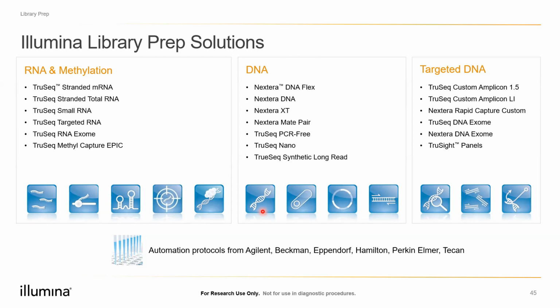Okay. So this, I think I will have to get back. I will get back over email on which kit for ChIP-seq can be utilized. And the instrument depends on how many samples you have and the data you require. So in that way you decide which sequencer to go for. So this has to be decided by the user. According to that, we can suggest which sequencer you can go ahead with. Regarding the library prep kit, I will write it over mail and share it with you.